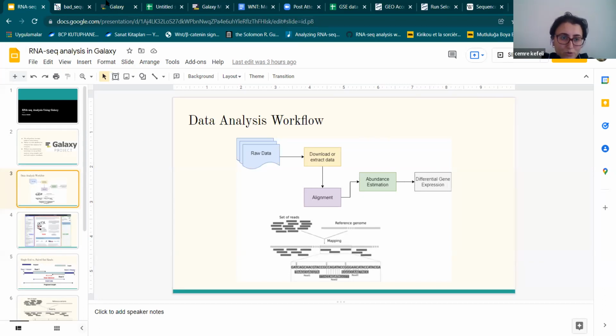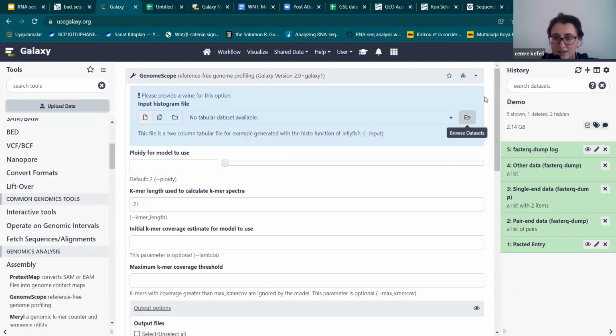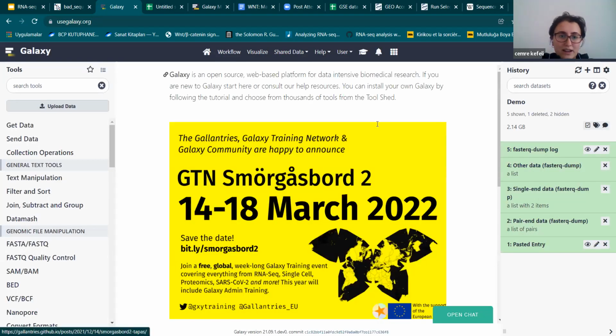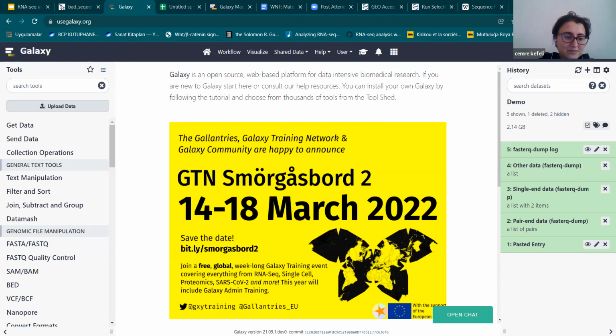And then I will go to Galaxy. Yeah, this is my Galaxy page. Sorry, you just went to usegalaxy.org. That is the address, no?